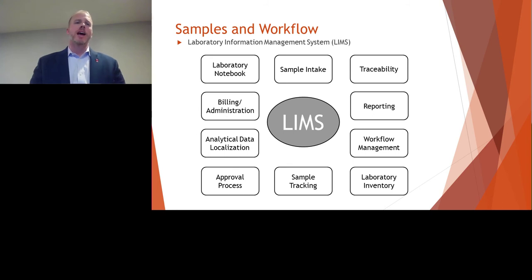Once they do data analysis, it may trigger somebody else for an approval process, so that you can have somebody do a peer review and then a final review before your data flows out to your clients. Some LIMS systems also have billing and can make invoices. Some will be able to produce your reports for you. And they are able to integrate in many different locations within the lab.